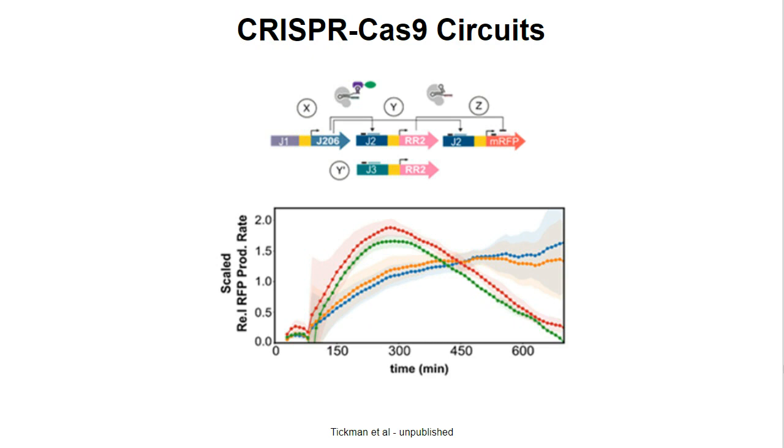And so we have these 4 genes. You can see X, Y, Z, and Y dash. X, Y, and Z, and Y dash would be a separate experiment, which is the control. And so by changing all the concentrations of all these genes, we have a lot of complexity.